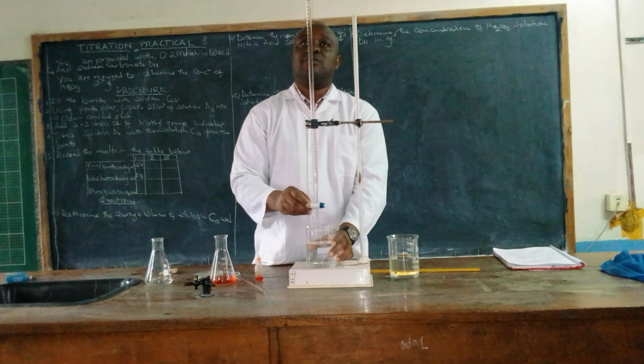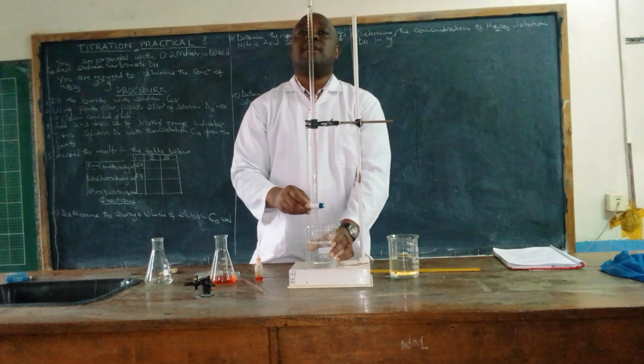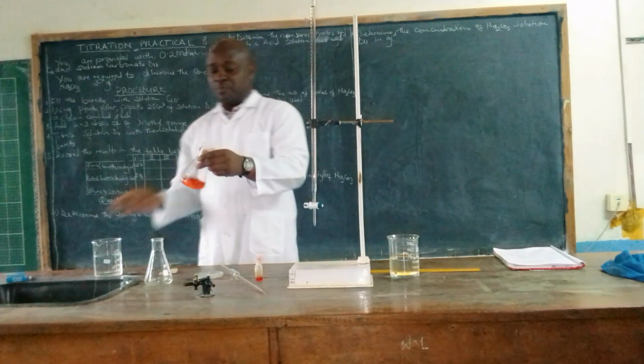So we are just trying to get to start at the 0.0 at the low meniscus, and also you are supposed to look at the meniscus so that you be accurate with your results. So this one, I'm just going to pour it away.